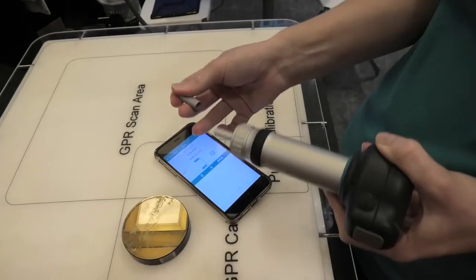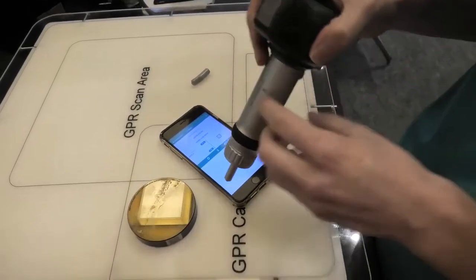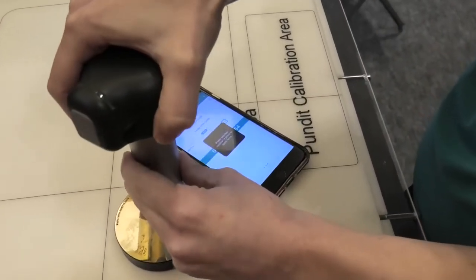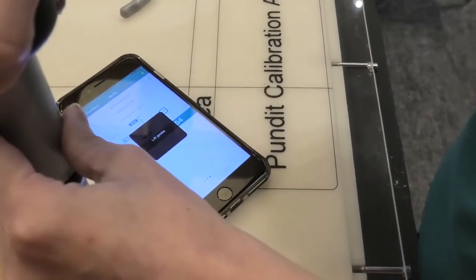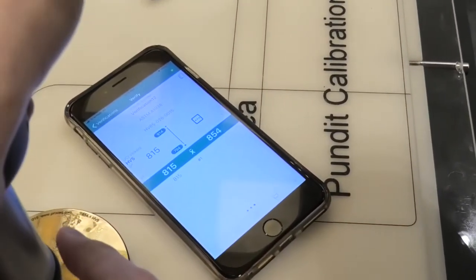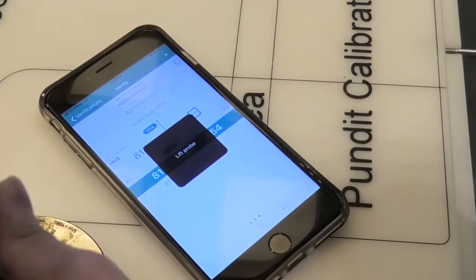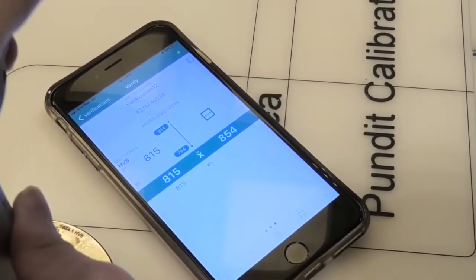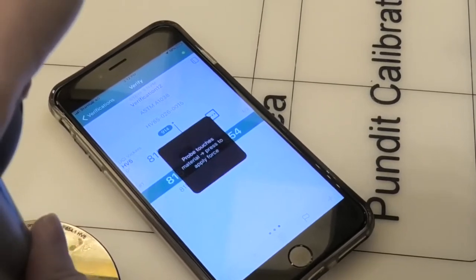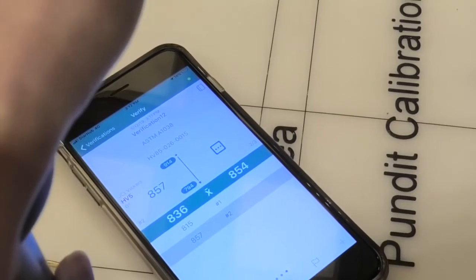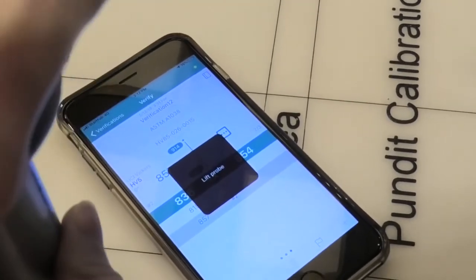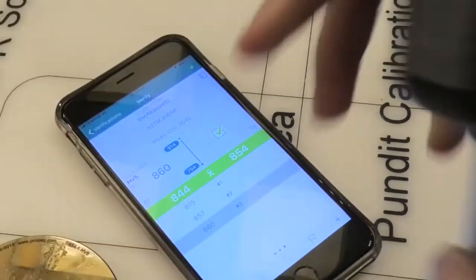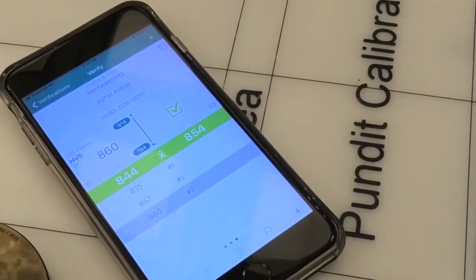We remove the cover of the probe, and then proceed to do the testing. So three values are sufficient, and you can see we've passed the verification.